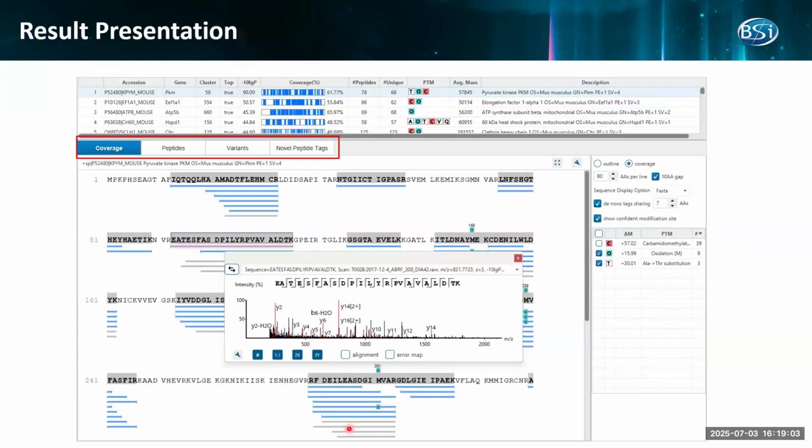And here is one example of a protein we identified from DIA data. You can see this is a protein, and with this protein, the blue bar supports that there is a precursor peptide matched with this sequence. For example, like this one, obviously this is the DIA spectrum. The other peaks may come from precursors in that window.